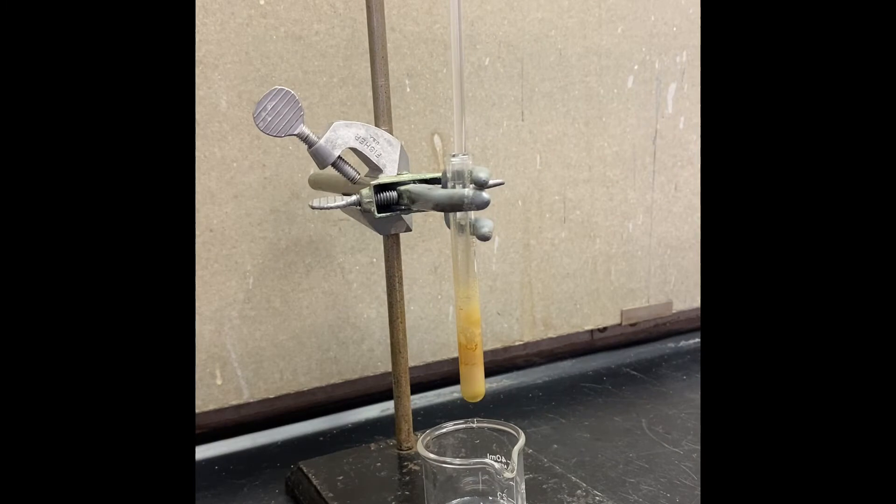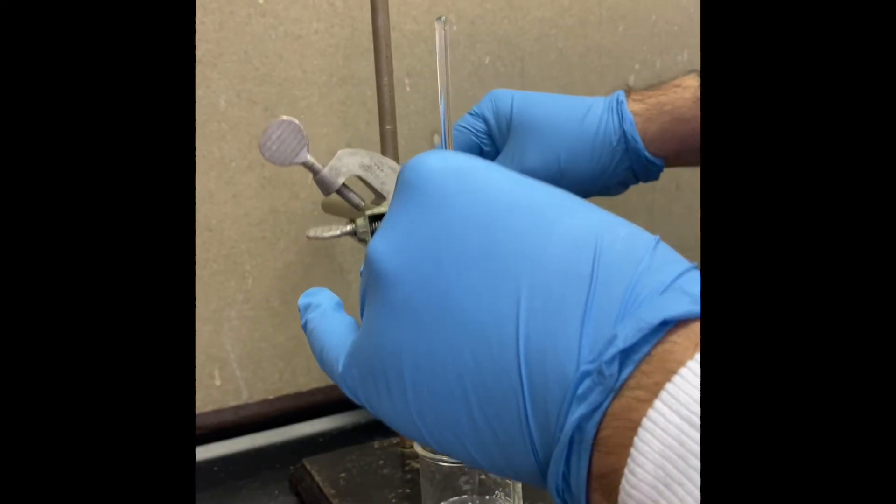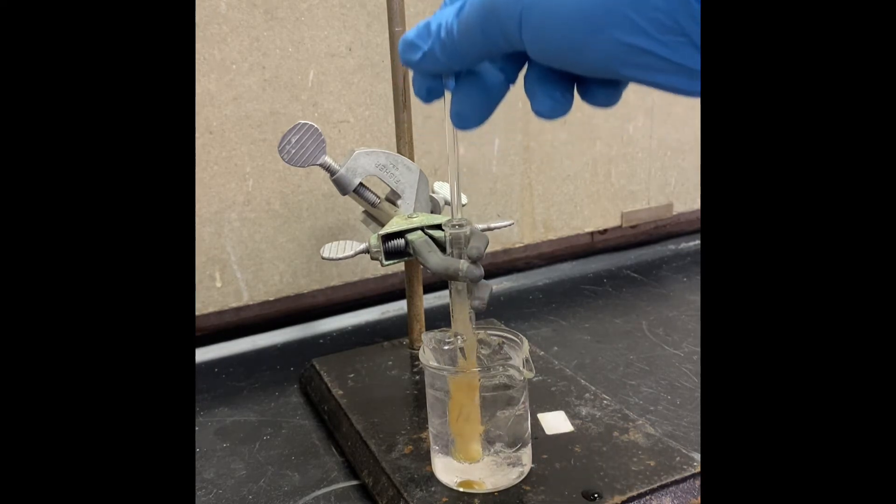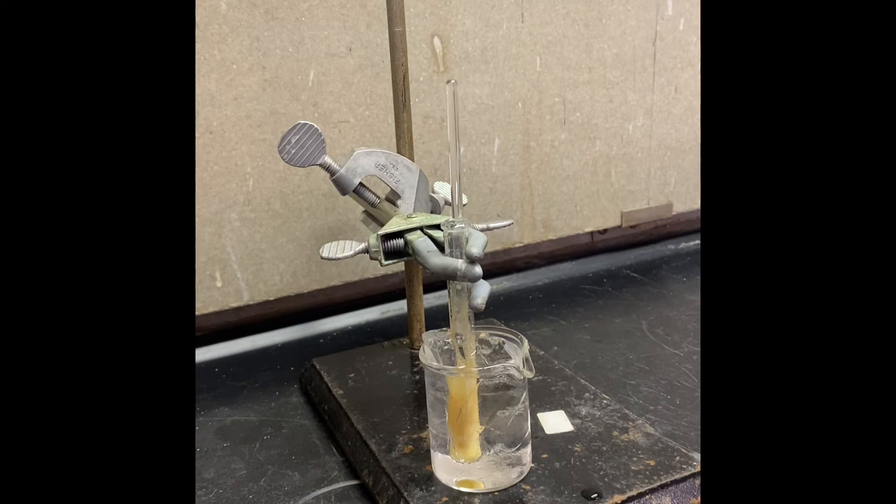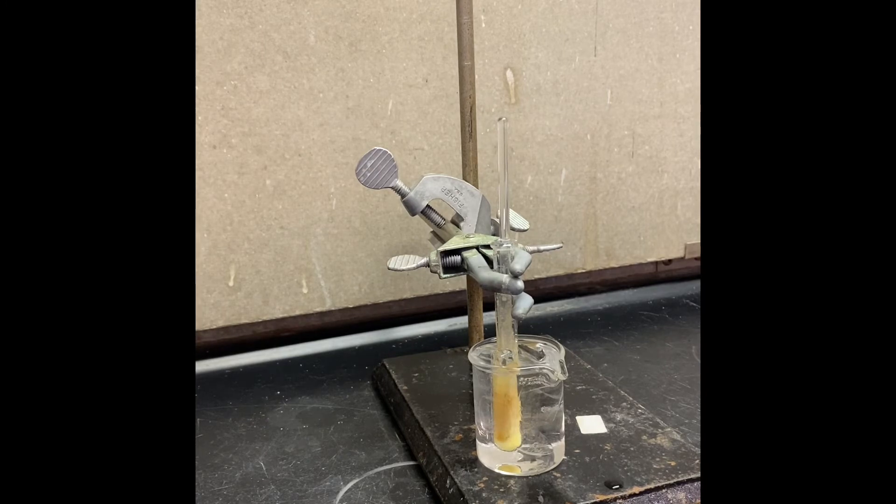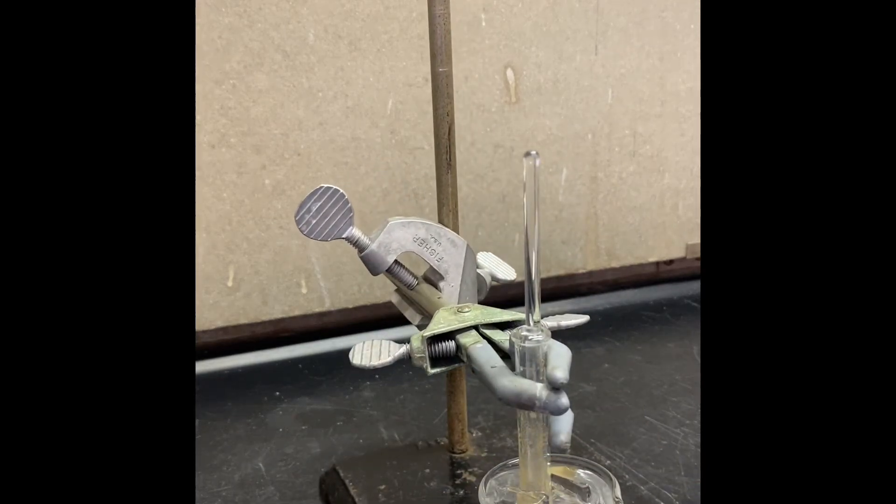We keep our reaction mixture at the room temperature another 10 minutes to complete the reaction and now we're going to put that in an ice bath, cool it down, and we're going to add the water. And once it's cooling up we're going to add two and a half milliliter of water drop by drop. We let it cool down our reaction mixture and now we're going to add the water, drop by drop, two and a half milliliter water.